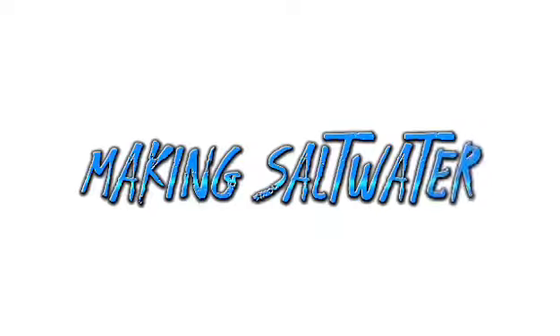Good day everyone! In this video, we are going to demonstrate a very simple experiment that has something to do with the properties of solute, solvent, and solution. This experiment is entitled Making Salt Water. This may be a simple experiment, but it explains what a solute and solvent is. It also briefly tackles how solid molecules, such as that of solvent, interacts with the molecules of solute and how they affect each other, and how this can be applied in real-life situations.